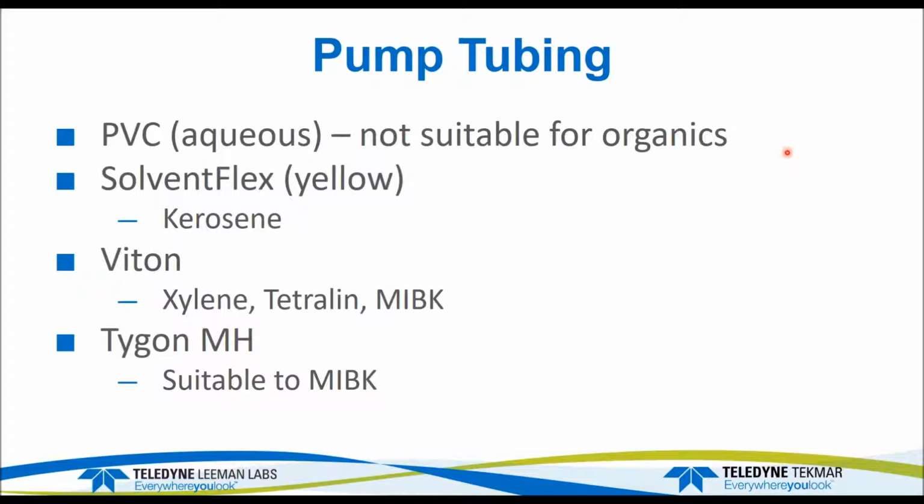For some of the other solvents, xylene, the petroleum solvents, and the MIBK, you need to go to Viton. Though I've always found that even using Viton with these solvents, the lifetime of the tubing is not very good. Normally within a day or so, you've got to replace the tubing. With solvent flex with kerosene runs, you can run that for days and days before you need to replace it. Particularly for MIBK, I don't really like using the Viton.